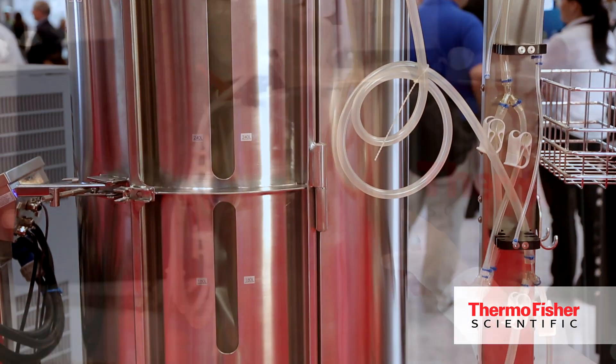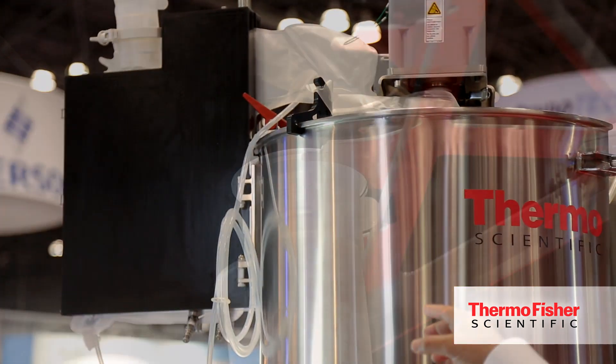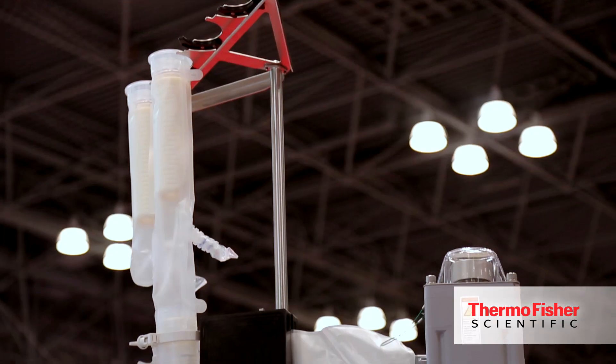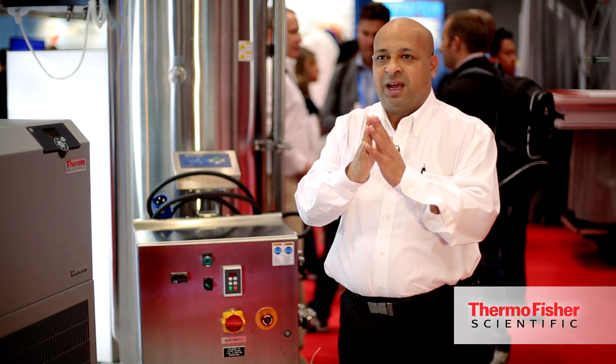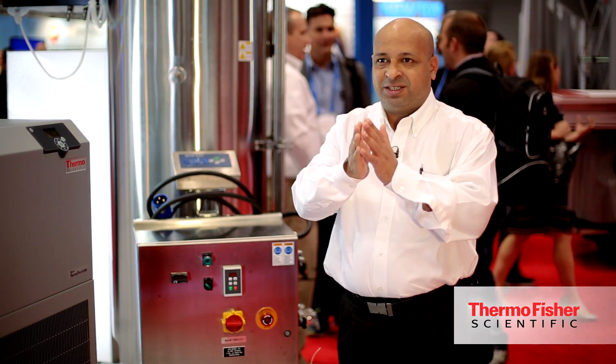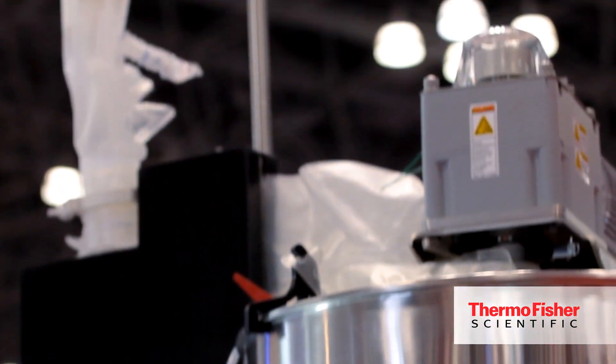If you look at that side, that's part of the exhaust management system. The gases go out from there and then get into a condenser, where all the moisture carried along with the gases is condensed.